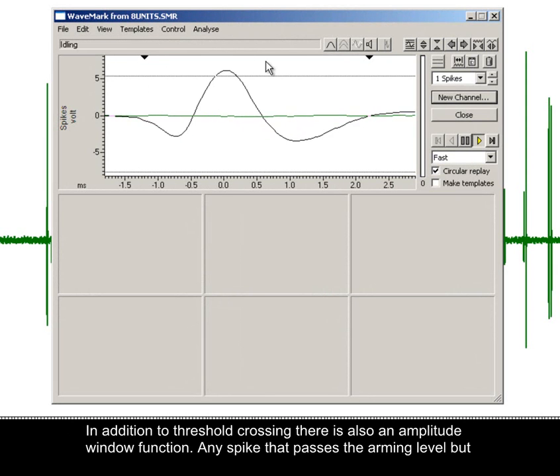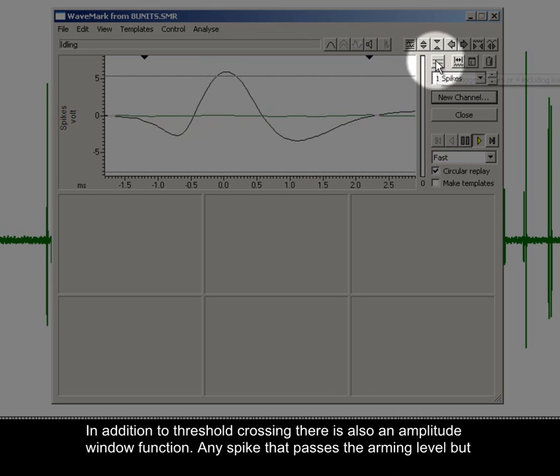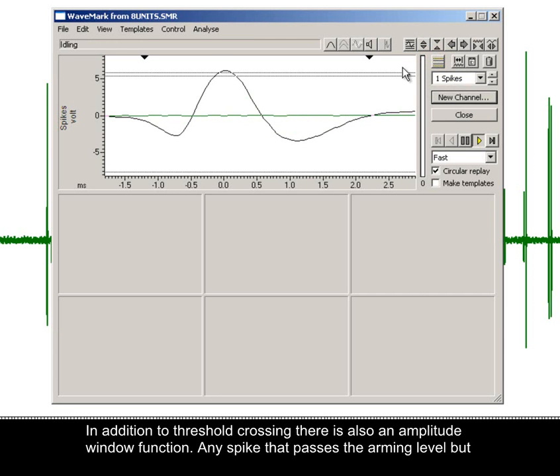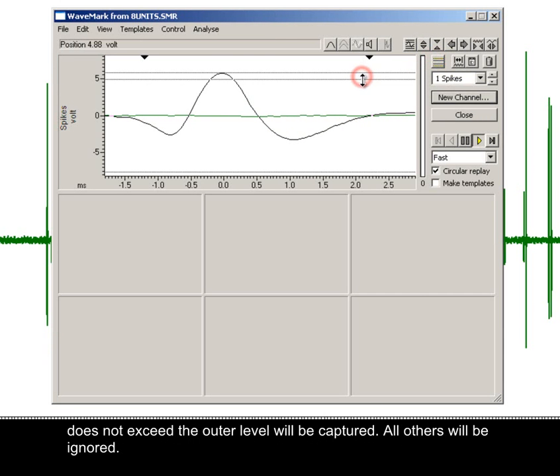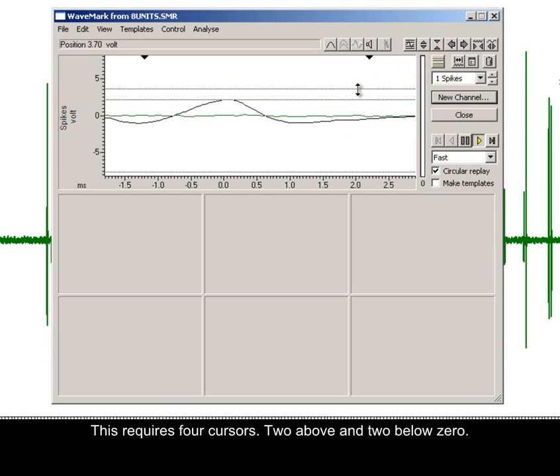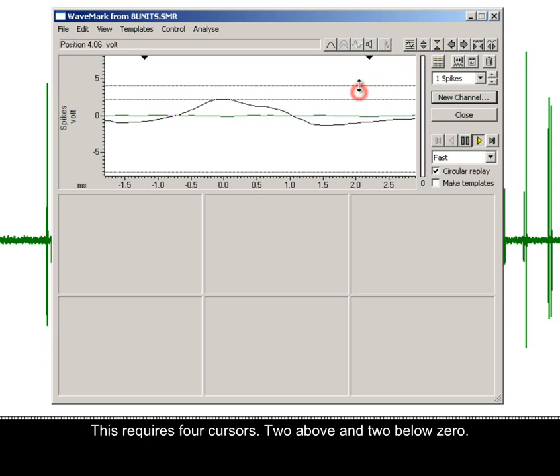In addition to threshold crossing, there is also an amplitude window function. Any spike that passes the arming level but does not exceed the outer level will be captured; all others will be ignored. This requires four cursors, two above and two below zero.